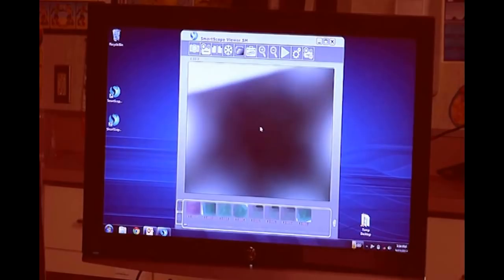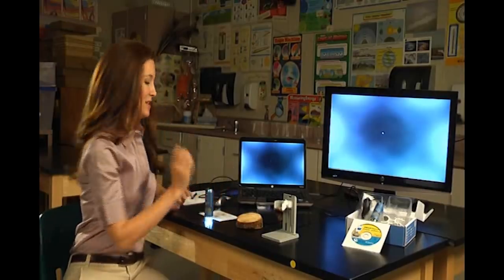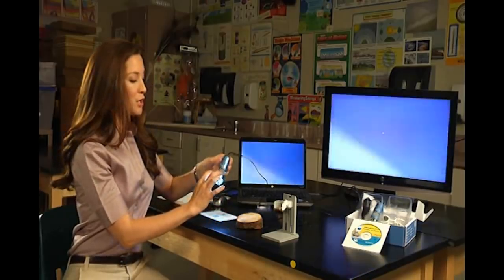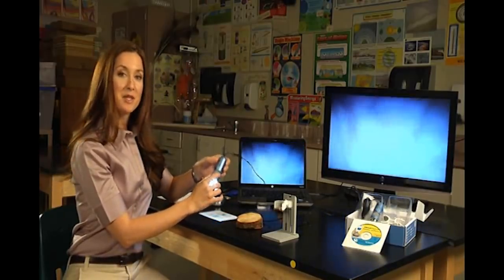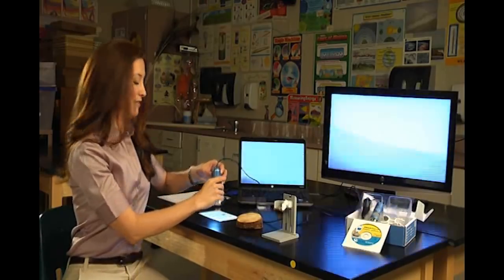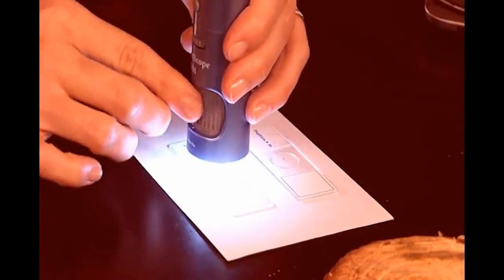First, I'm going to double click on the image. That'll take us into full screen mode so everybody has a clearer view. You can use the SmartScope 5M just like a traditional microscope. So first, I want to analyze a slide of an onion skin. You're going to want to use the dial at the bottom of the SmartScope 5M all the way over to the right to start off. Then you'll place it on the slide and then slowly turn the dial to the left. You'll see the image come into focus.